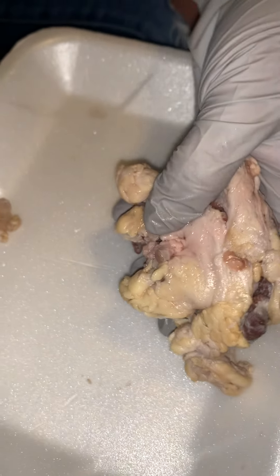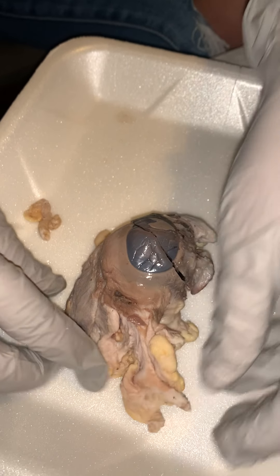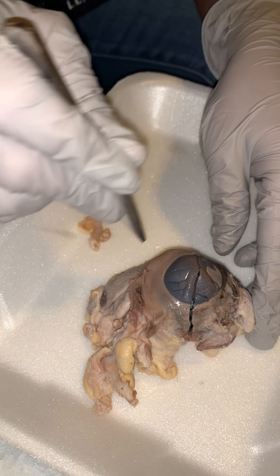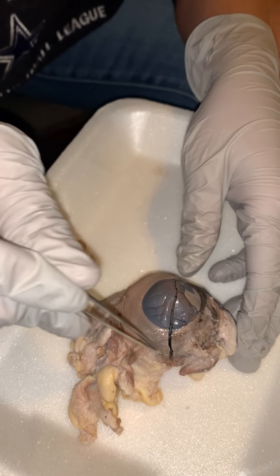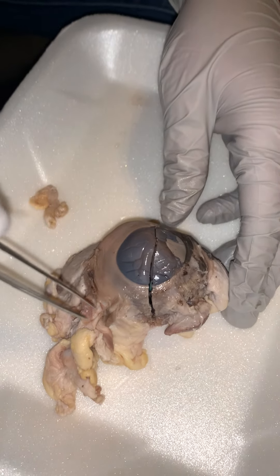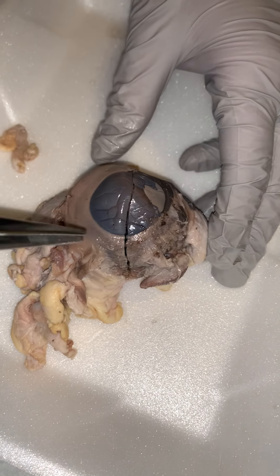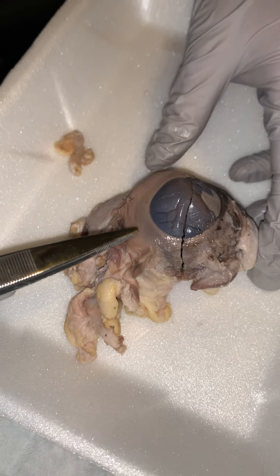Okay, flip it back over. So we have our sclera. The sclera is usually white, but considering this has been sitting in preservative, it's more of a grayish brown — but typically that would be white. And then you would have your cornea, and those layers would kind of be just one — they would join together: cornea-sclera.